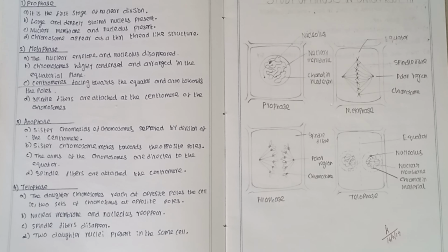Mitosis occurs in somatic cells. After mitosis, one cell gives rise to two identical daughter cells with a diploid condition. There are mainly four stages in mitosis: prophase, metaphase, anaphase and telophase. In the practical section, we usually get a metaphase slide because it is very clear.